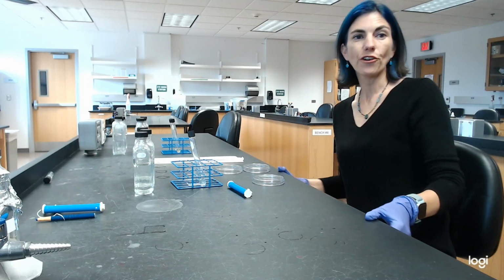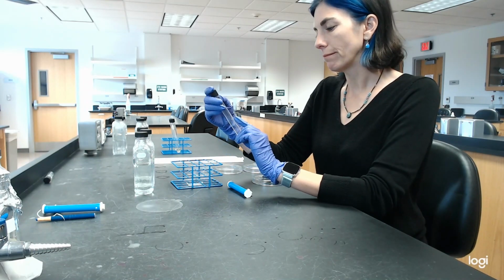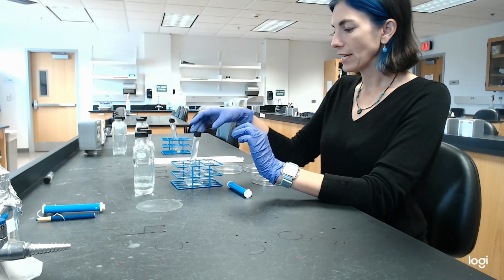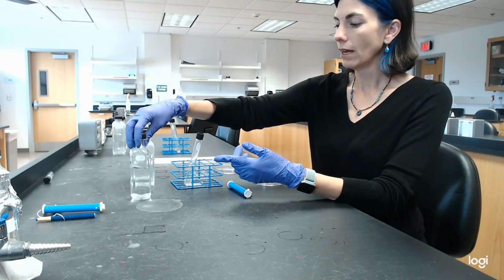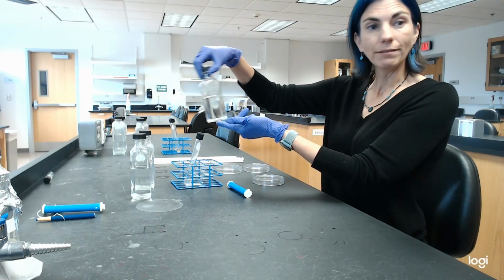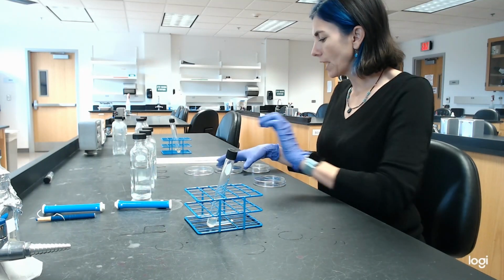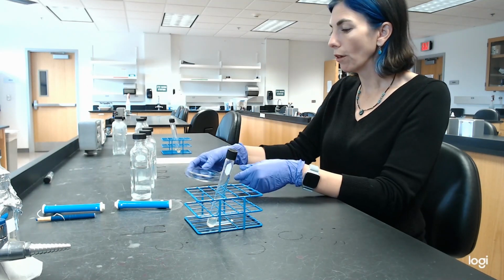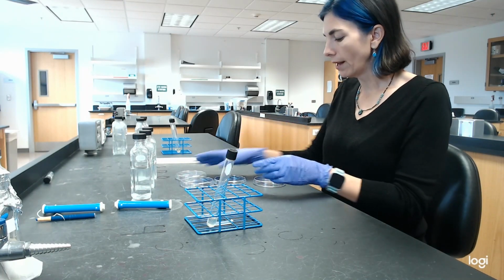Okay, so I have the first setup for my urine, not urine, this is going to be my control. So this is my E. coli with LB broth. And you'll recognize the setup. I have 3 bottles: a bottle labeled A, a bottle labeled B, and a bottle labeled C. In addition, I have 4 Petri dishes labeled 10 to the minus 4 control, 10 to the minus 5 control, a 10 to the minus 6 control, and a 10 to the minus 7 control.